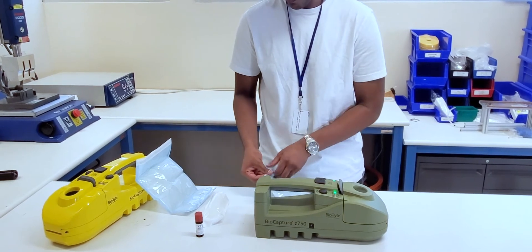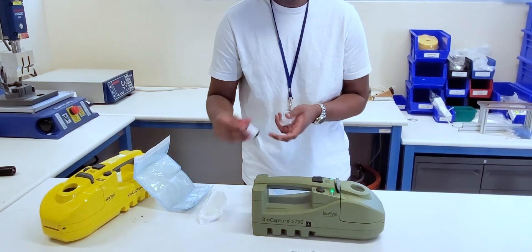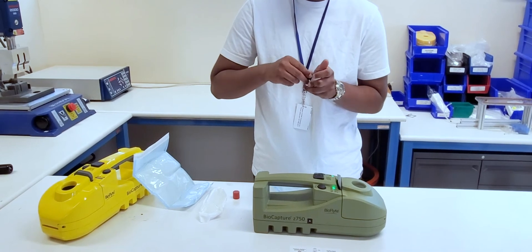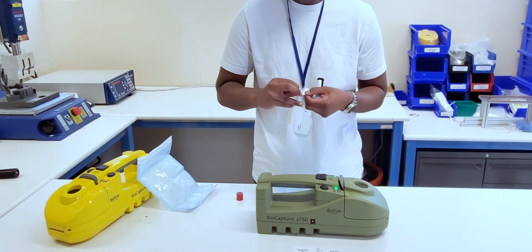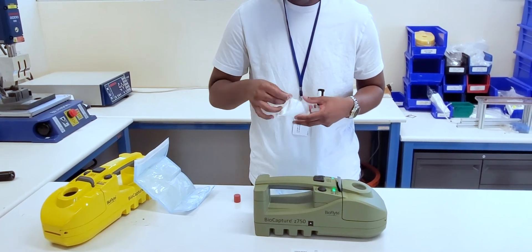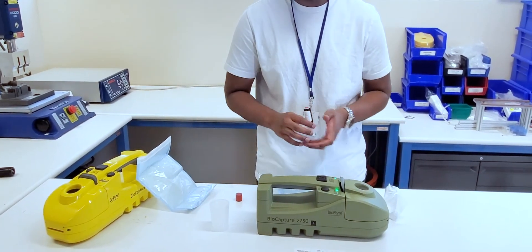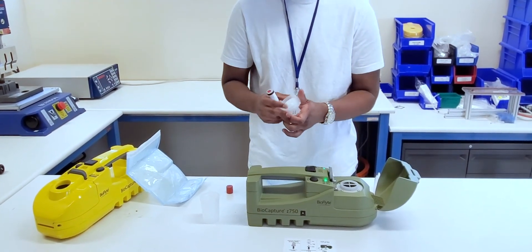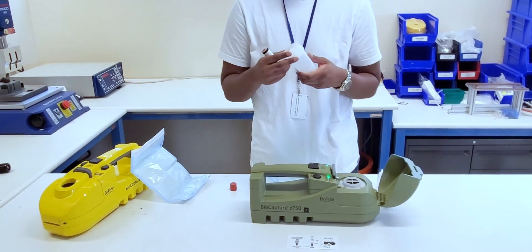We will prepare our elution by taking out the adapter, attaching our vial to the adapter, and getting our vial ready. We can now remove the filter. We will attach the filter onto the vial, and note that it will only attach in one direction, and you'll hear it snap in when it's ready.